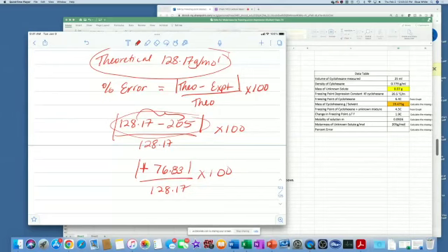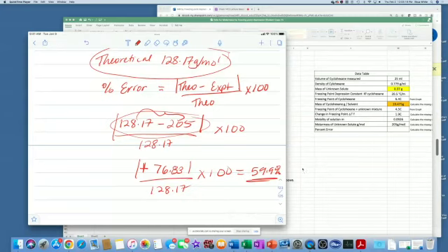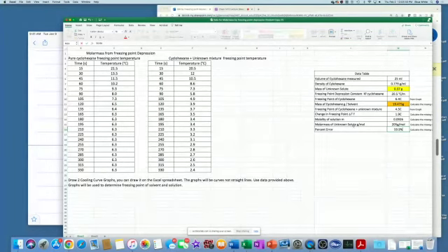Times 100. Okay, so I was 59.9% off target, considering the issues I was facing. Y'all saw what happened. Not bad, right? But yeah, so my percent error here, I could round up to 60, but who wants to do that? So 59.9%. Okay. Any questions about this?